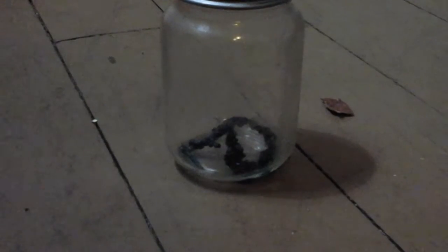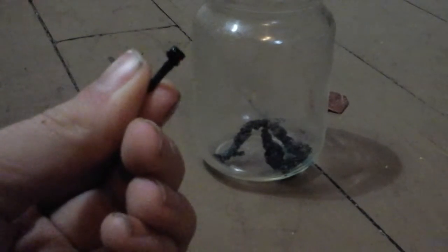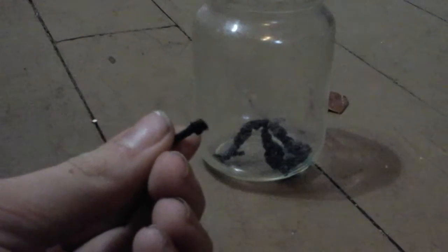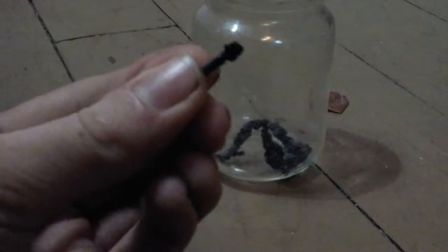It kind of looks like rock candy, but it's blackish blue. Pull out my little one. This is a piece that formed on a little piece of copper. As you can see, it has a pretty cool shape, and that's pretty much it.